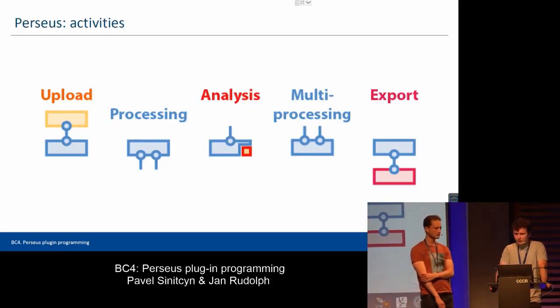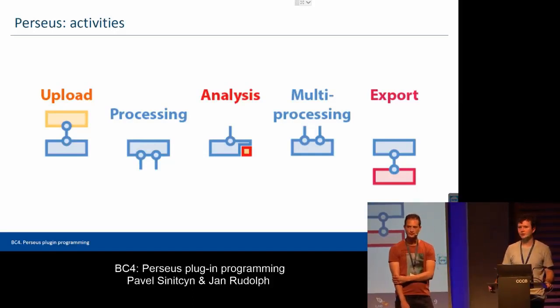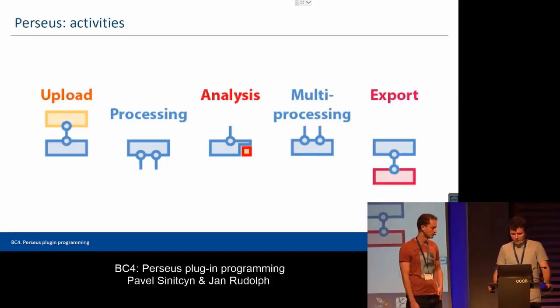And export is clear from the name. Basically, you have some matrix and you want to export it as a table and, I don't know, upload it somewhere. Okay, cool.